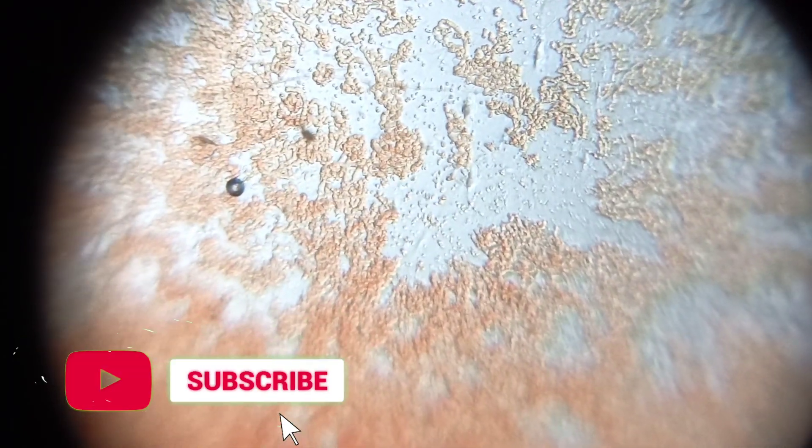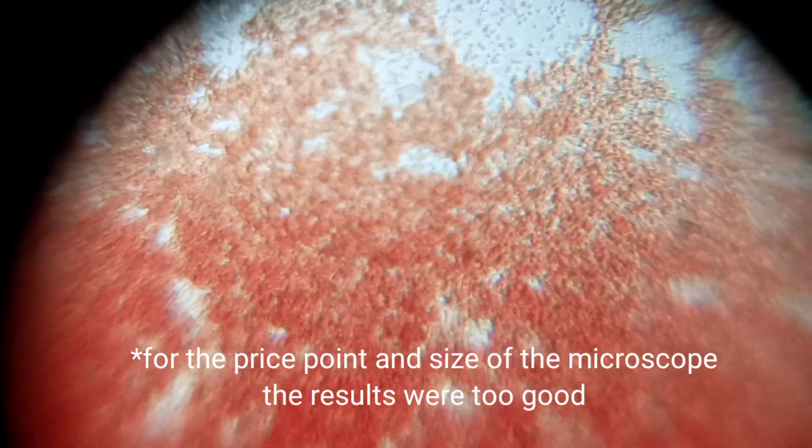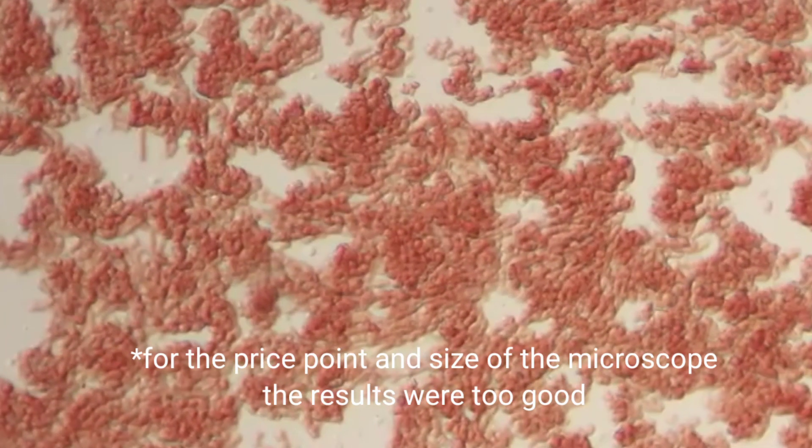Now I'm attaching it to a phone. Look at that — my blood cells! The white blood cells are floating on the blood serum. Can you see that? Red blood cells and white blood cells. The clusters of red ones are RBCs. Let me zoom in — look at the clusters.